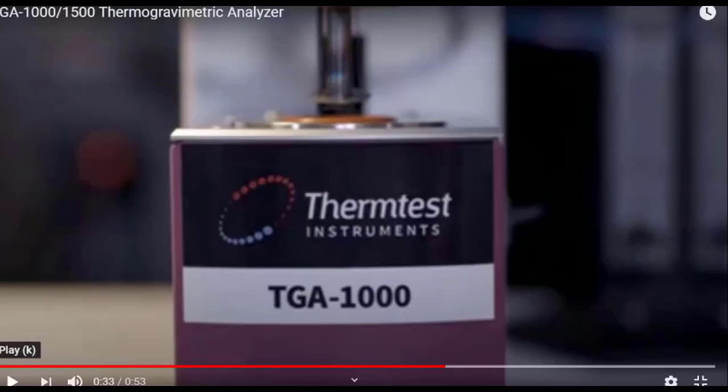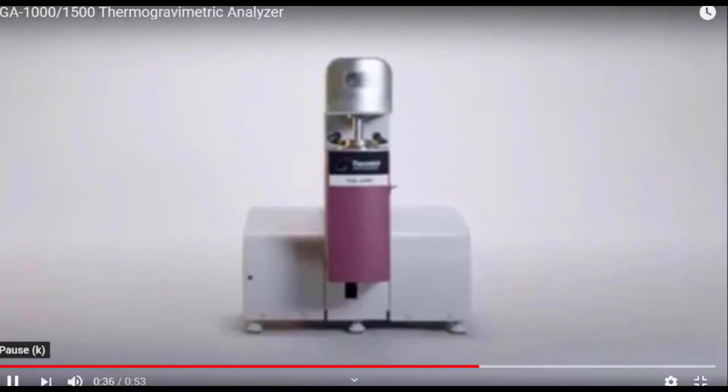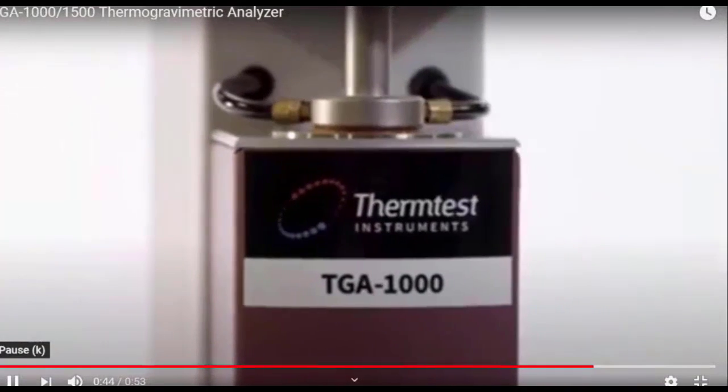And you can see the sample is kept and the furnace is going up. So when the furnace is going up, the sample is going inside the furnace. Thermal decomposition, and solid gas reactions. The Infinity Pro software is used to control and record data, as well as analyze results from the TGA instrument.